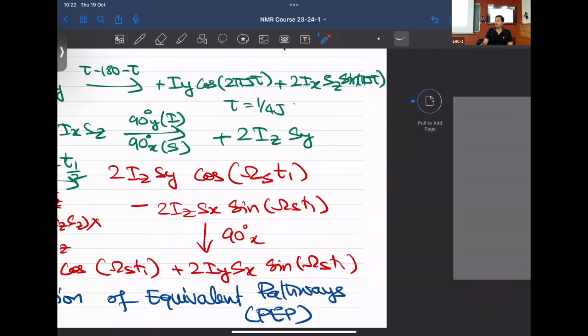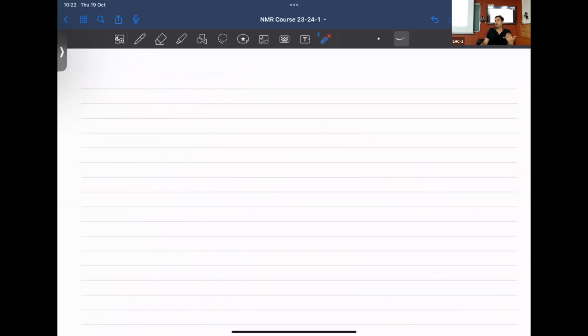What I would like to do right now is to give you a little bit of flavor from the experimental perspective on how a 2D spectrum looks. We have seen this quite a bit in the one-dimensional spectrum of camphor. We also saw the help it would do when it comes to DEPT experiments. So let's go back to the example of camphor. Count the number of carbons and protons. Look at the proton 1D, carbon 1D. Maybe start looking at the HSQC.